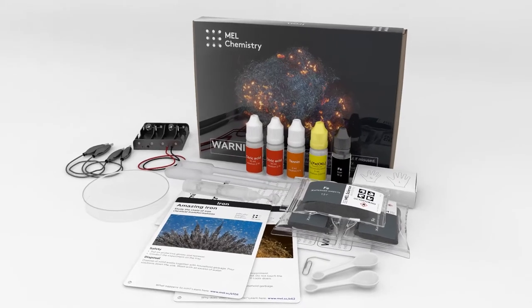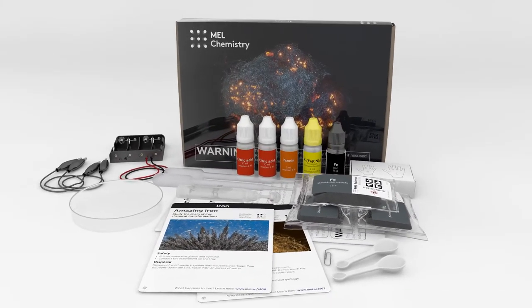Welcome to the wonderful world of chemistry. Today, with the help of the Iron Set by Mel Chemistry, we will ignite steel wool with the help of electricity.